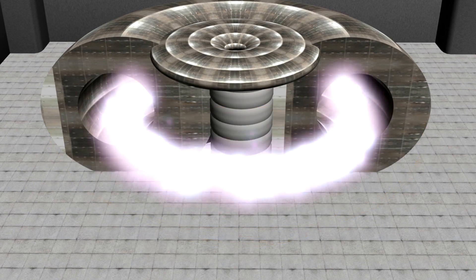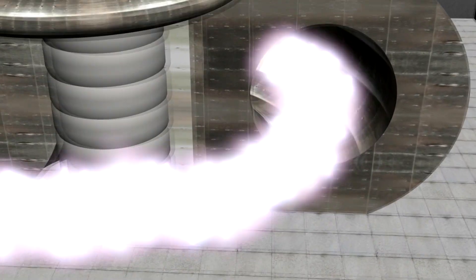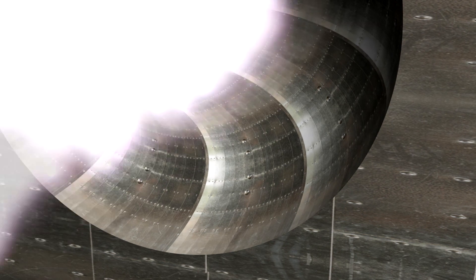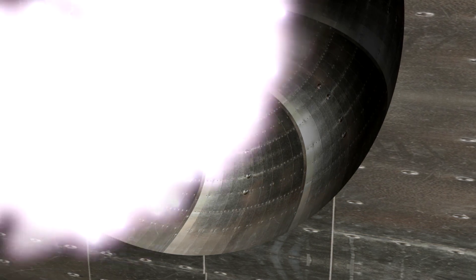Ideally, the plasma in the reactor never touches the walls, but the contamination of fuel by fusion reactor products and other impurities over time is unavoidable.